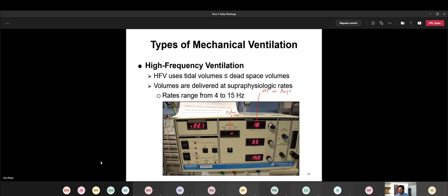And then over to the side, it's hard to tell, but there's a little mechanism that will lock it in place. To me, it looks like a combination lock. When you're turning the little knob on the combination lock and you're seeing the numbers go by, you'll see the numbers in this little window here. Because this moves so easily, it's so easy to make this little knob move, they include this little locking mechanism.